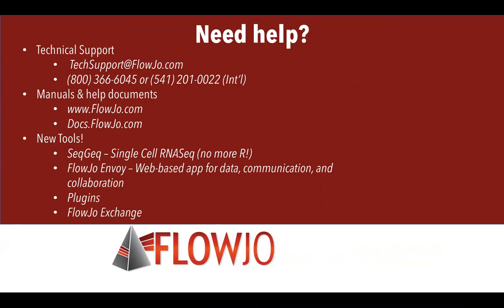Anyway, we also have another product called FlowJo Envoy, which is a web-based application for basically project management. It's nice because it presents you with a dashboard of your progress on a given experiment. And it keeps all of the data and all of the communication about the data in one place, which is really nice because when the PI asks you to go find so-and-so's data who left the lab a year ago, it's been very difficult to do that when you're just looking at a regular server. But if you use FlowJo Envoy, it makes that search a lot easier.